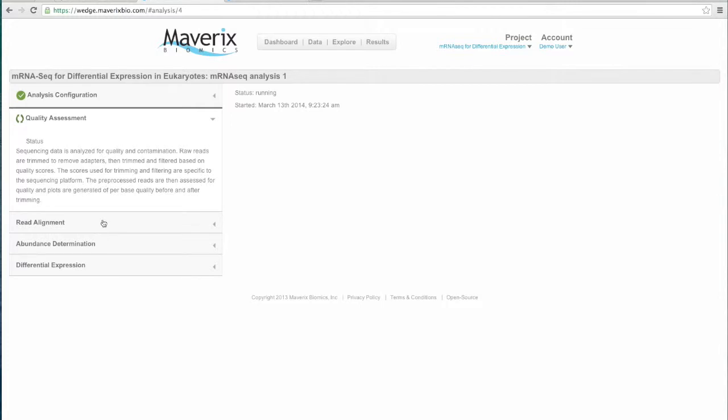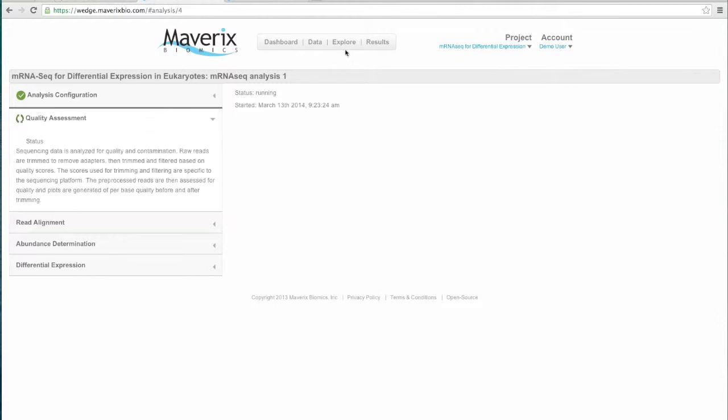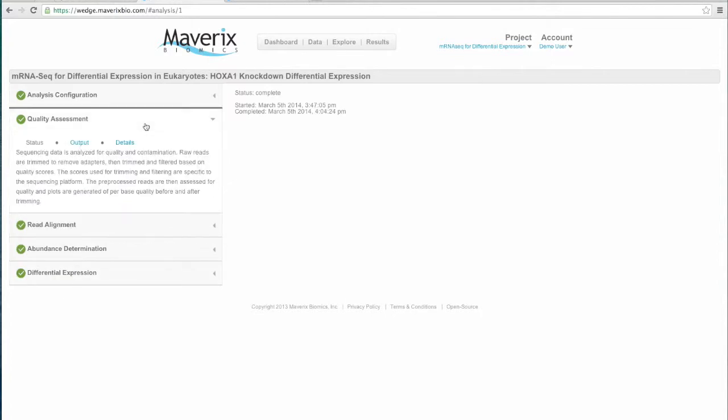As you open up any of these steps, you'll get a description, and this was sort of what you were seeing when you were looking at the analysis overview. It's a description of the step, what's happening within that particular step in the analysis, as well as some of the outputs that you might expect. So since this one is running, I'm going to show you as an example one that's already completed. So here's analysis that's completed, and now we can actually take a look at some of the other information that's being published to the platform as the analysis runs.